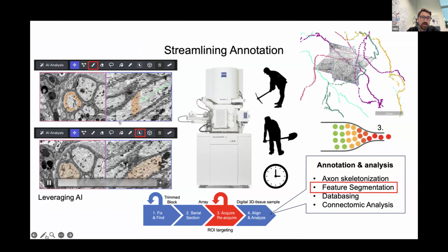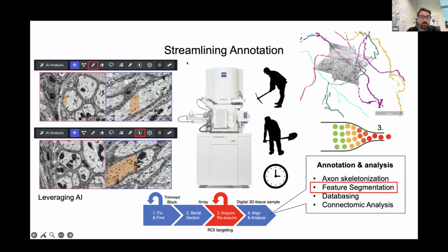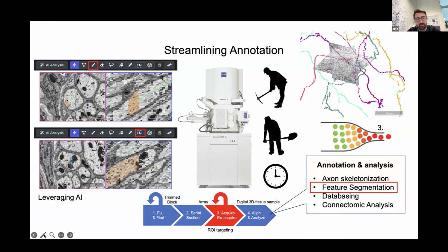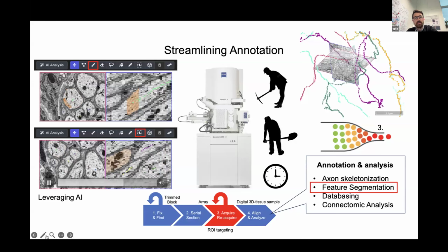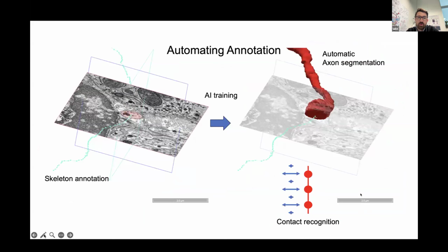So at the top here, to give you an idea of when we started, we would be manually segmenting axons that we thought were interesting enough to segment, because they'd all been skeletonized. And then recently, since it was introduced, we have the AI tool for segmentation, where you literally just click on, or you can draw a box around, the axon, and it will segment it for the next sort of 16 slices or 20 slices, depending on how you play with the settings. So this has really been a step forward, and is beginning to improve what we're doing.